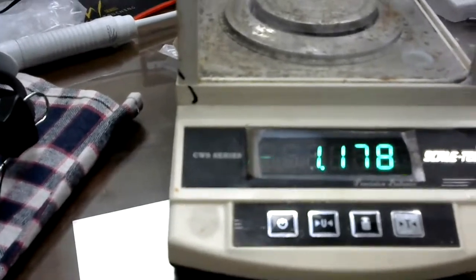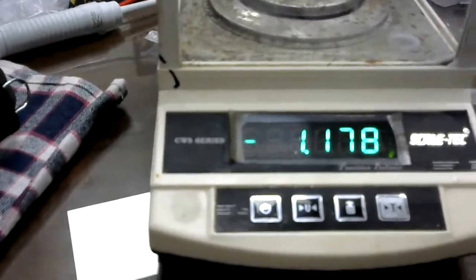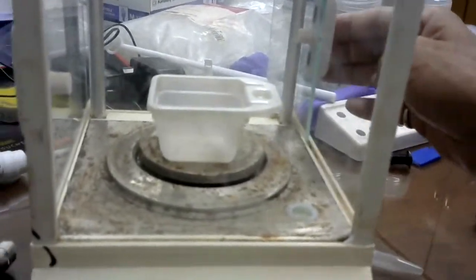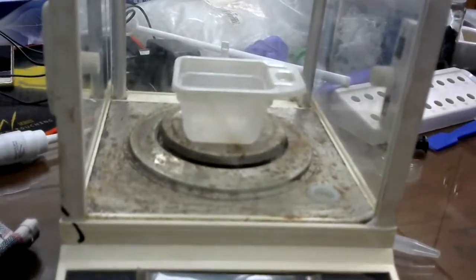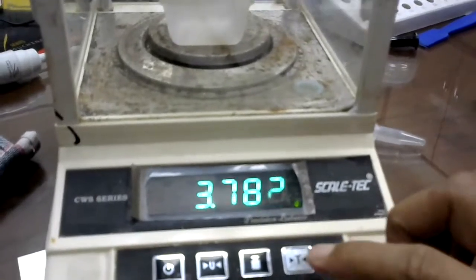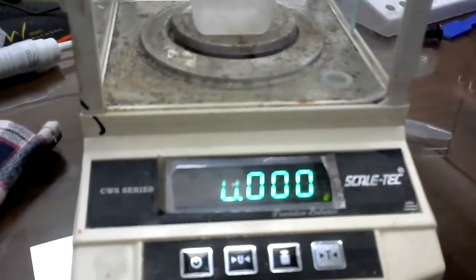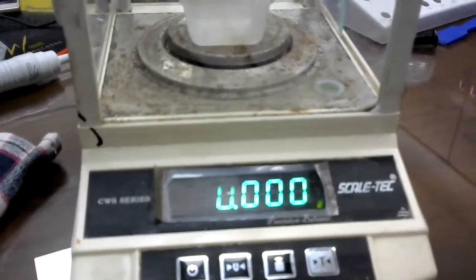But if you want to weigh something, where do you weigh? Either you have to put some paper or you have to put a weighing board. Here, this is the weighing container, an empty container. The weight of that container is 3.782. I want to tare it, which means the weight is now nullified, 0. Then I want to put some chemical there and weigh how much it is.